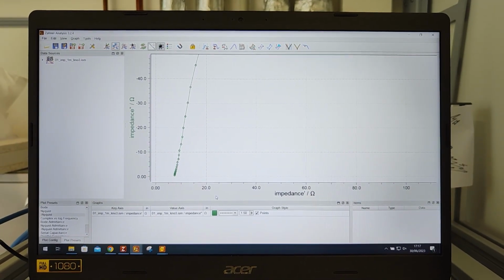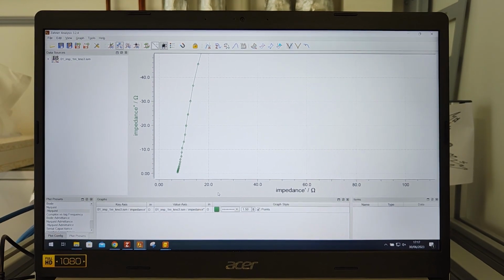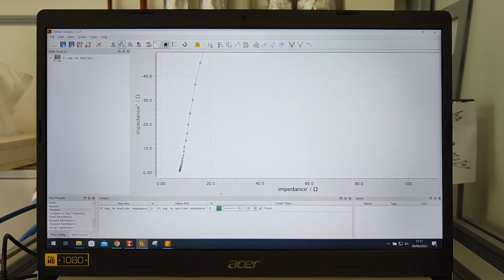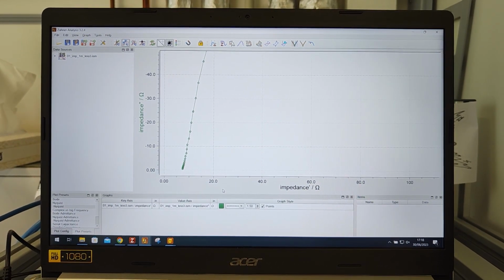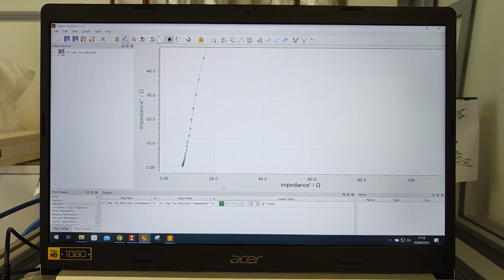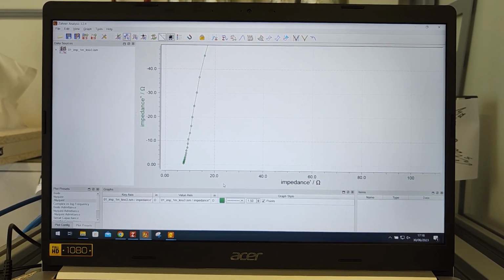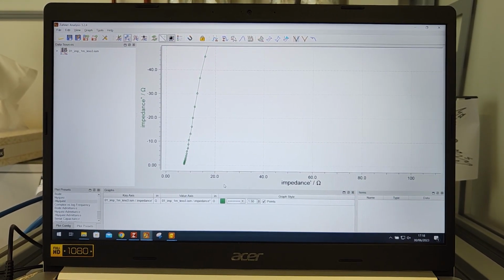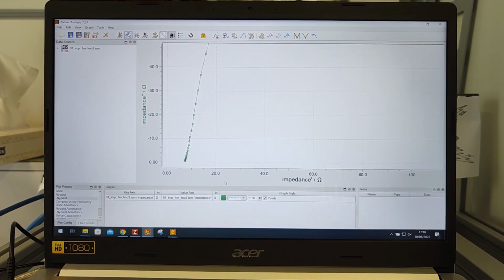Before actual measurements we did impedance spectroscopy of the conductive salt without the redox pair, and here you can see a typical RC series circuit. It's a linear behavior that is not perfectly parallel to the imaginary axis of the Nyquist plot because it's a real, non-ideal system.